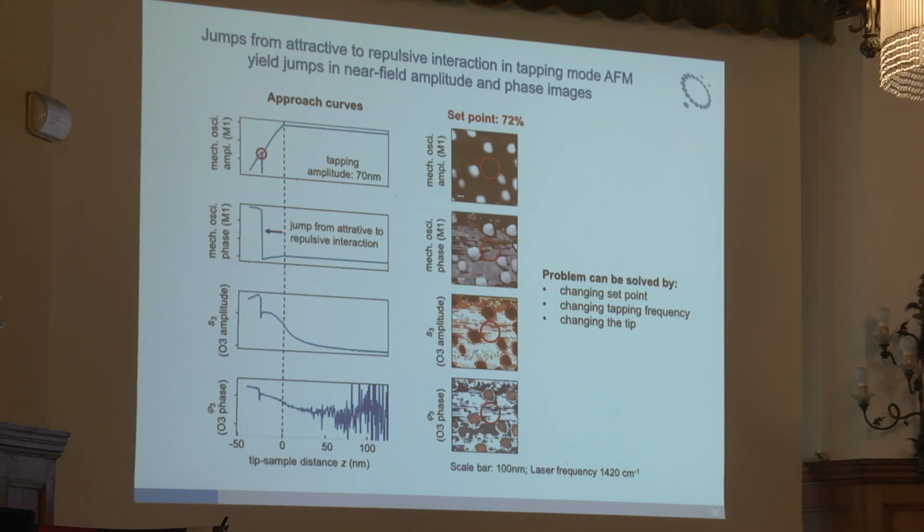For example, now we have this repulsive interaction, and that's like really hitting. What happens is that the sinusoidal motion could become anharmonic. So we could generate a lot of higher cantilever harmonics, cantilever modes, and that could lead to, let's say, modulation of the background. That could be the reason for this jump here.